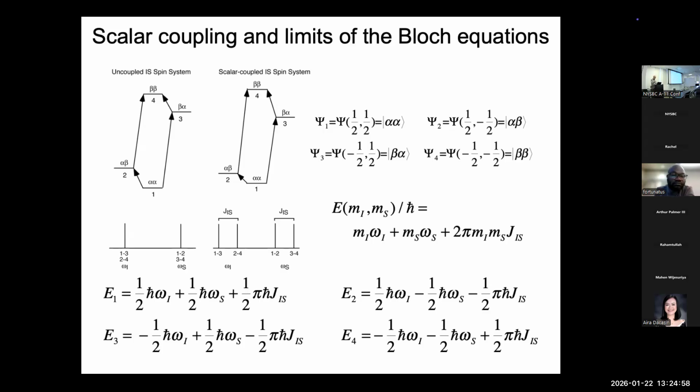how strong the polarization effects are also depends on the gyromagnetic ratio. So it's different if you have to pass through the different heteronuclei. But anyway, it gets weaker for obvious reasons. And as a result, the one bond coupling, for example, between the nitrogen and the amide hydrogen is about 92 hertz.